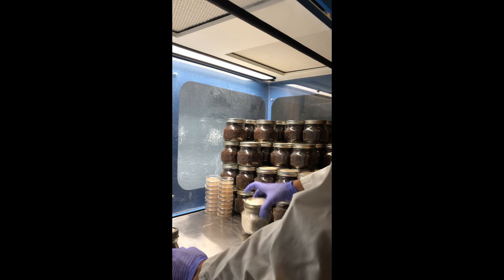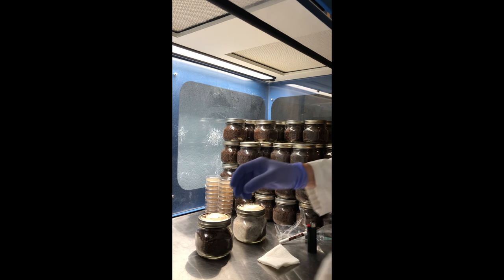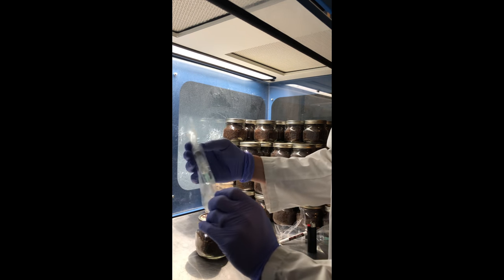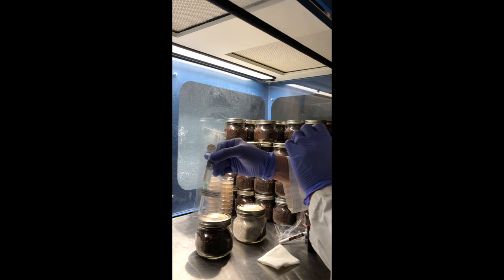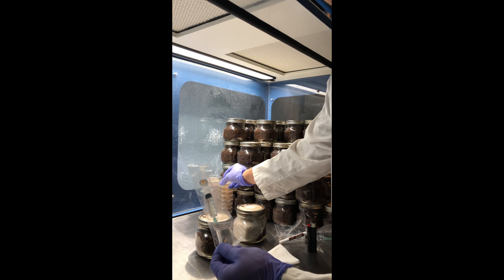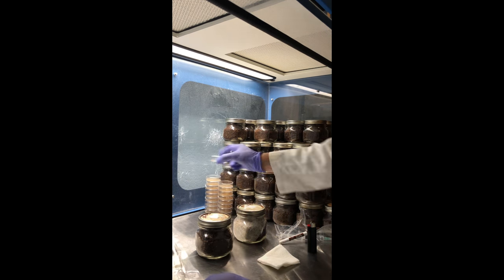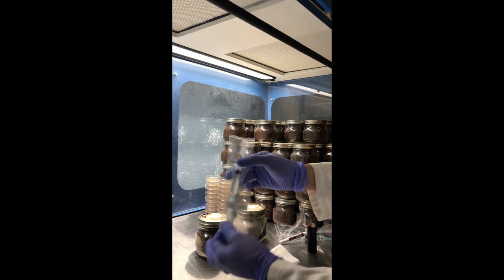In a couple weeks' time, you should have some healthy mycelium growing. These are all liquid cultures, so they should already be selected for optimal growth. We test all of our syringes on an agar plate, so we make sure that they're free of contaminants.